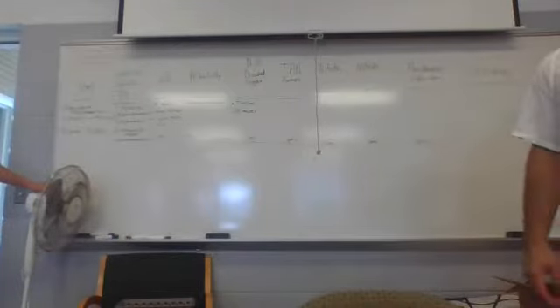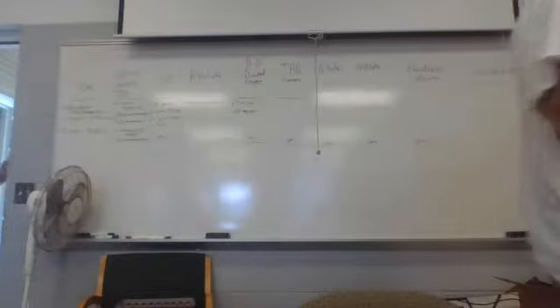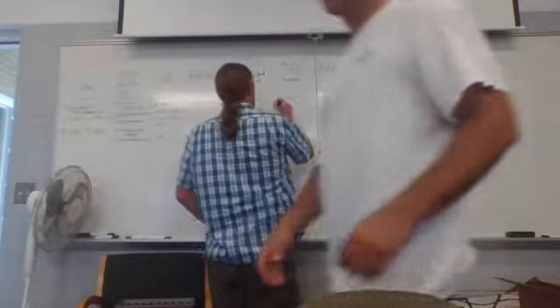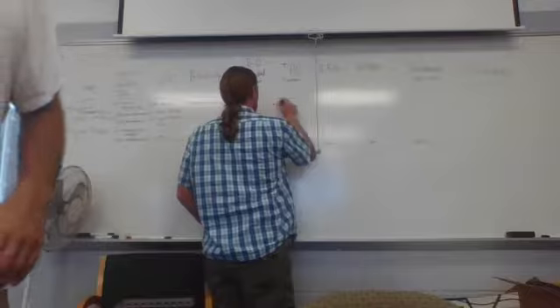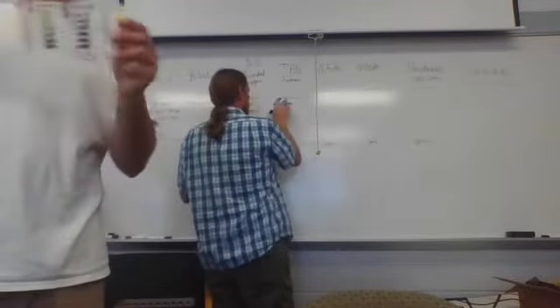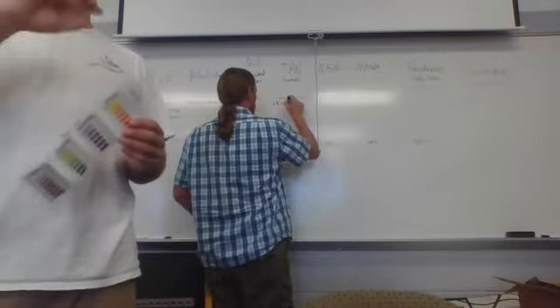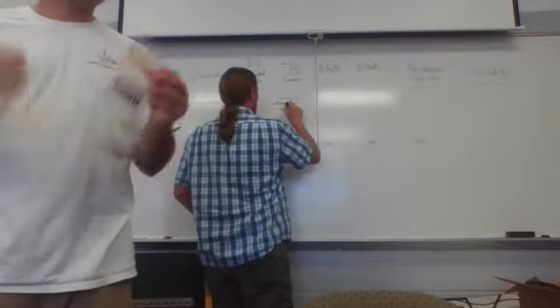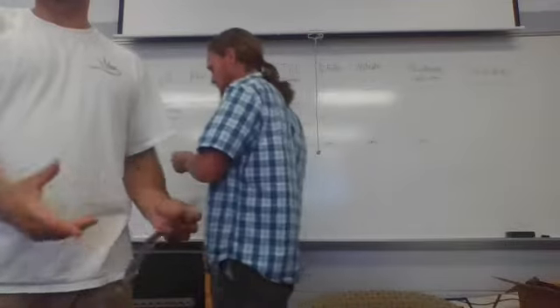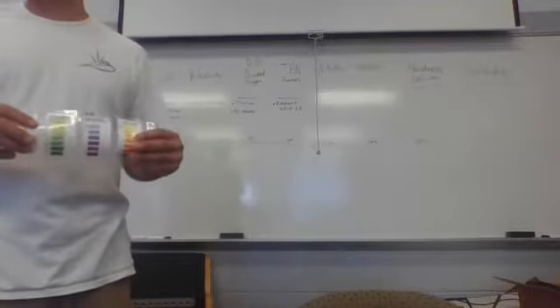Ammonia. What can you think of for ammonia? The dropper test thing we did with it. Okay. So that is a sort of a dropper test kit. How many different bottles did you have to put in for ammonia? 2. So you put reagent number 1, reagent number 2, and it reacts. What color does it turn if you have ammonia? Green if there's ammonia, yellow if there's not.